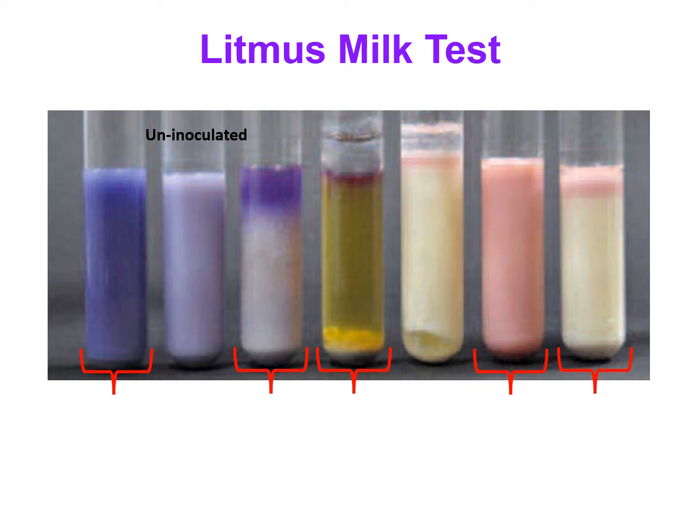Now, those are some more images for you, actual images so that you guys can see how it really looks like. So again, this is how you start it off, okay? You start off with an uninoculated broth. And as I said, it contains milk, and that's why it's kind of opaque, right? Because of all of that protein milk has, the casein protein. But again, what milk contains as well is the lactose, okay? So there's definitely the protein casein in here. There's the lactose sugar. What else is in this test tube? The litmus, right? The pH indicator, litmus, okay?